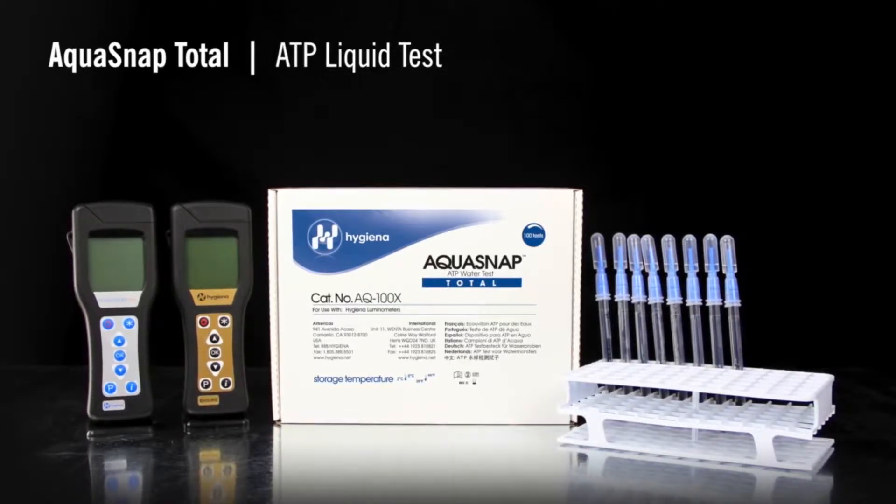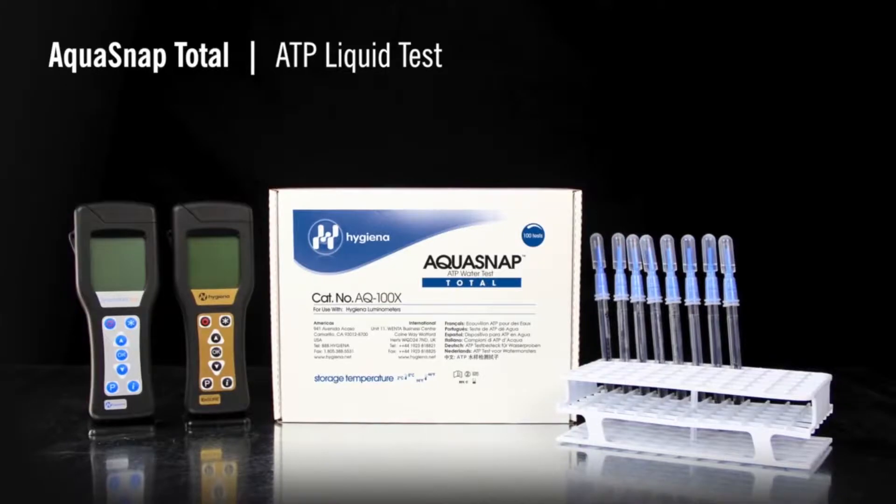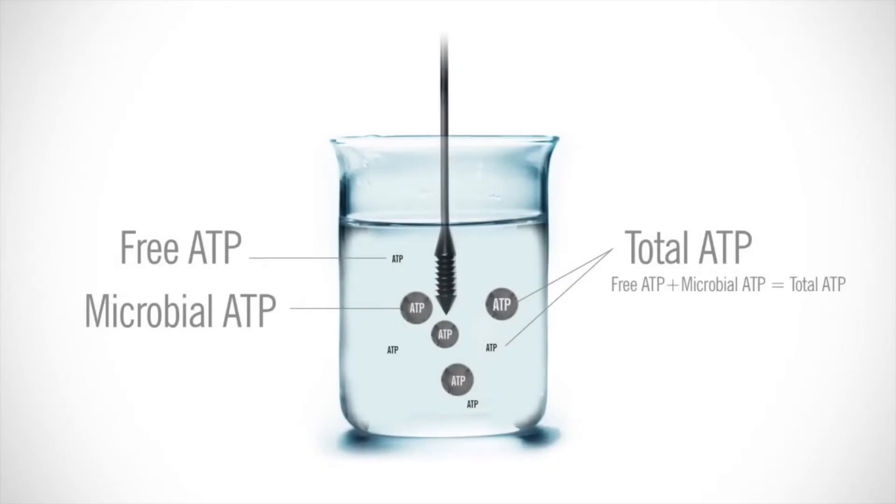The test device is available in two different variations, free and total. AquaSnap free measures dissolved ATP that is free-floating in solution. AquaSnap total measures both free ATP in solution and microbial ATP.